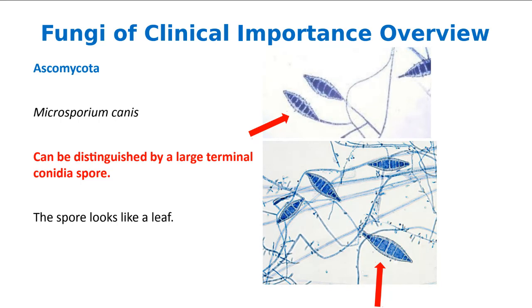Now the other two, Trichophyton and Epidermophyton, are hard to spell and hard to say. So I picked Microsporum because it's easy, right? Some people might pronounce it differently, and I guess that's okay. But if you look at these organisms, they're so easy because there's only one conidium, or one spore, that's formed off of the mycelia.